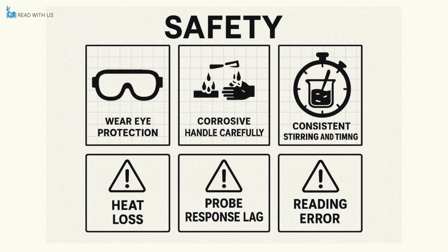Safety and quality panels highlight eye protection, careful handling of corrosive solutions, use of a lid and insulation, consistent stirring and timing, and notes on common errors such as heat loss to the cup, slow probe response, and inaccurate readings.